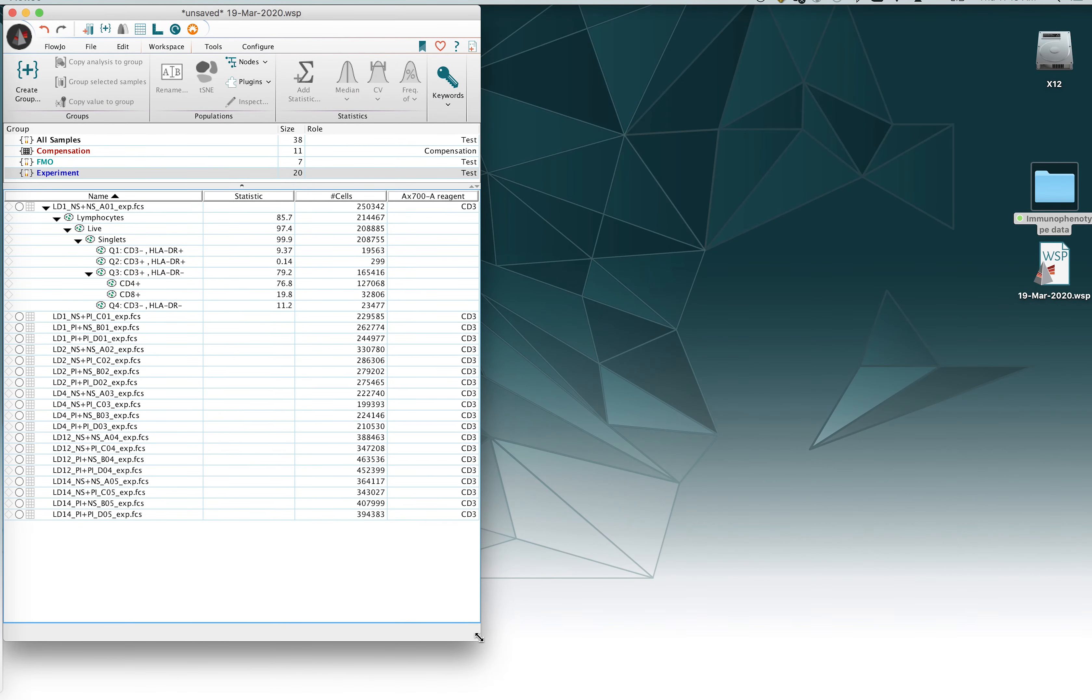Hi, my name is Jack Panopoulos and I'm an application scientist for FlowJo. Today we're going to be talking about how to copy gates to a group and how to edit existing gates that have been copied to a group and also how to delete a gate that's been copied to a group as well as synchronizing your gates. So it's all gate focused in this short video tutorial.